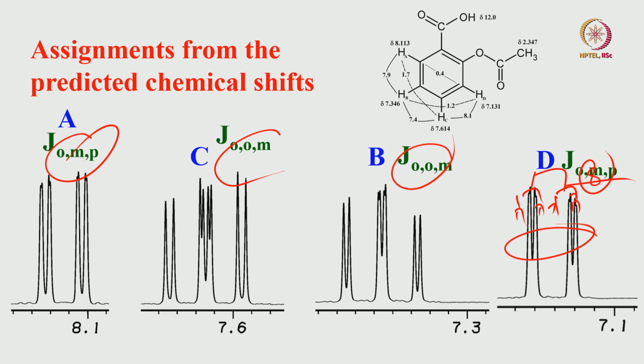That is easy, but only in the case of the phenyl group we have to be a little bit careful, because in the phenyl group we have 3 different couplings, ortho, meta and para, depending upon the substituent, whether it is symmetric or asymmetric, whether it is ortho, meta or para substituted, depending on that we have different multiplicity patterns for different protons, that we understood how to do.